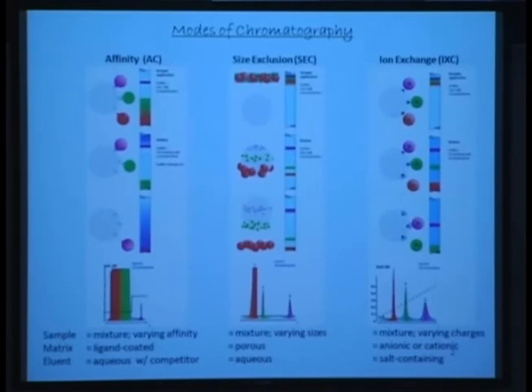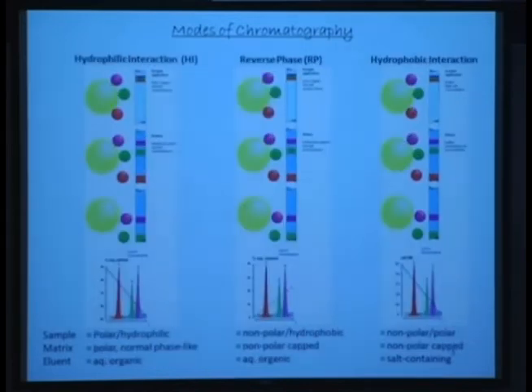And what is done is that by using a very high concentration of salt, you force the molecules together to bind through hydrophobic interaction. Okay, so it's exactly opposite. This is opposite of what conventional wisdom is, but that's a very nice exploitation of the technique.